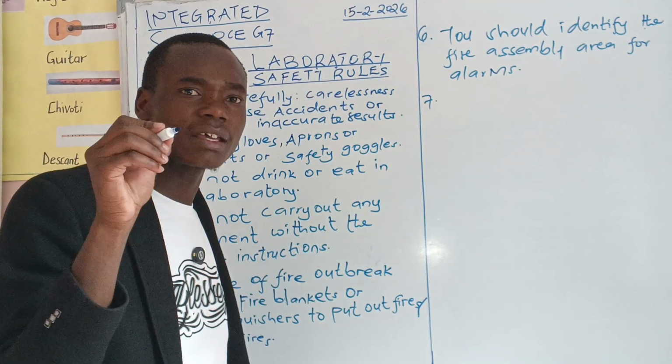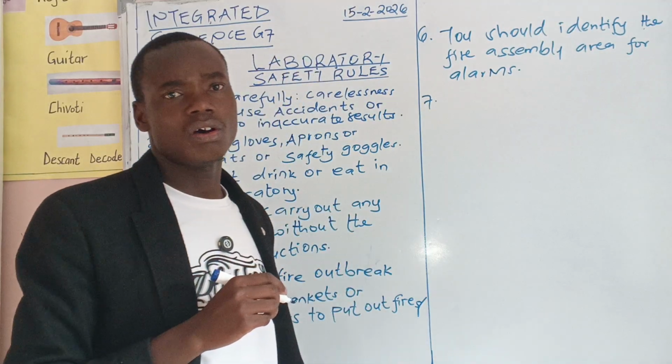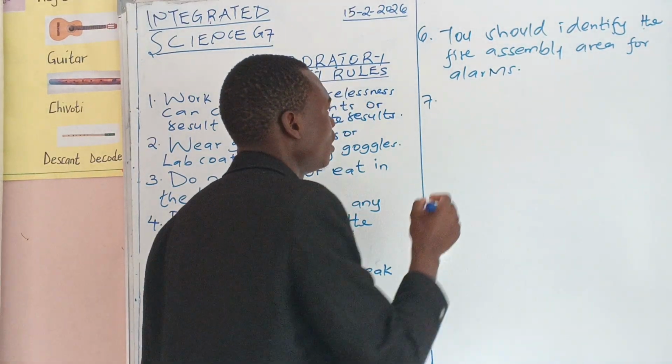Now, how about when a chemical drops in your eye? What are you supposed to do?